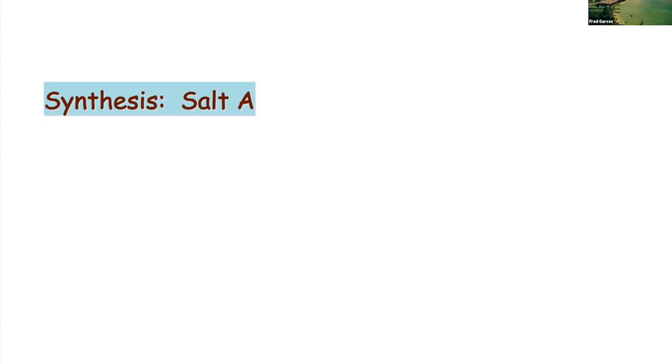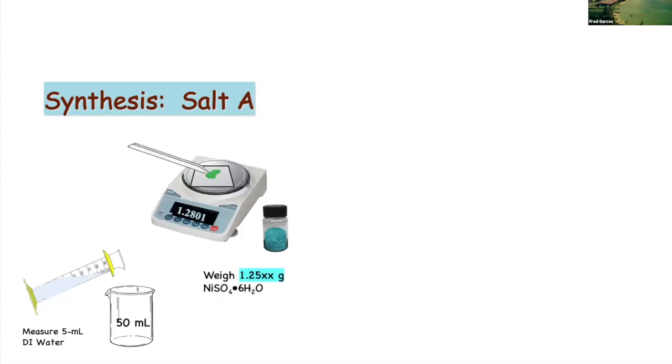In terms of synthesis A, you guys are going to start with 5 mL of water, put it in a 50 mL beaker. You're going to weigh about 1.25 grams plus or minus. In this particular case, I weighed 1.2801 grams of nickel sulfate hexahydrate.